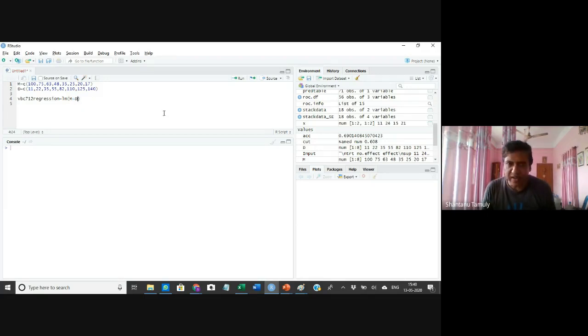If I put enter here, this will do the regression analysis between the distance traveled and the molecular weight. But remember, we don't want the molecular weight. We want log 10 molecular weight. So for this, just M is there, I'll write it as log 10 M. Earlier I put M versus D. Now I put log 10 and the bracket M versus D.